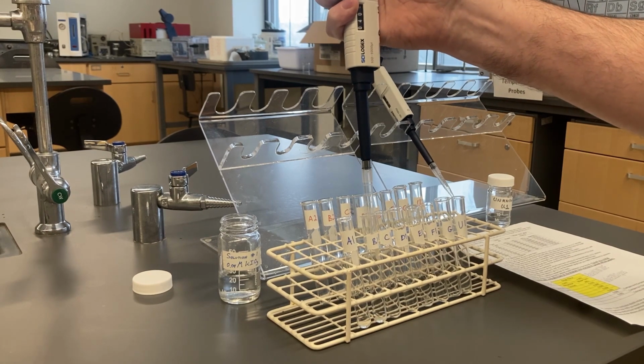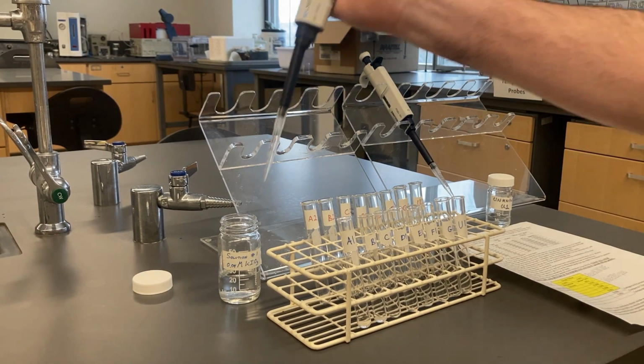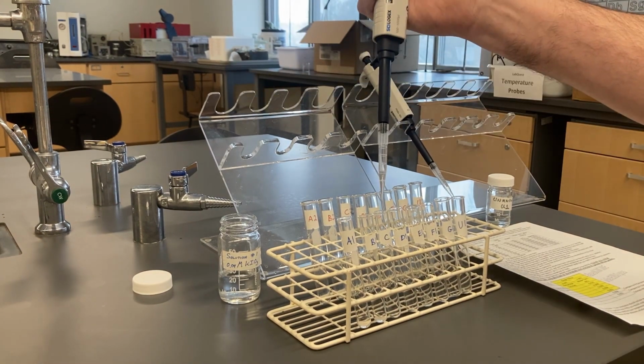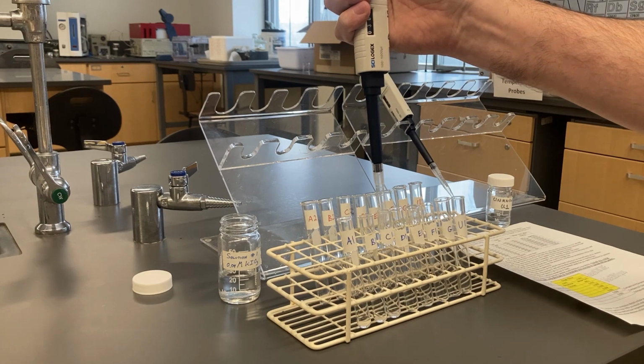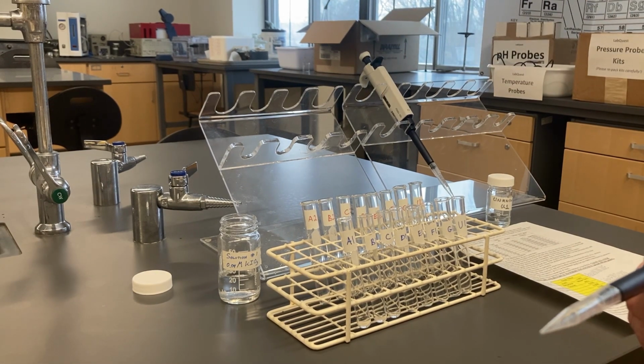I'm sorry, B1 gets 400. And then C1 gets 300. D1 gets 200.